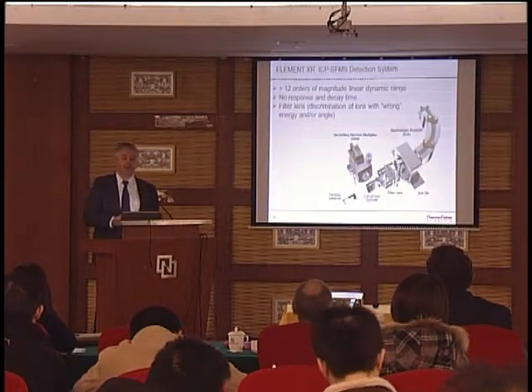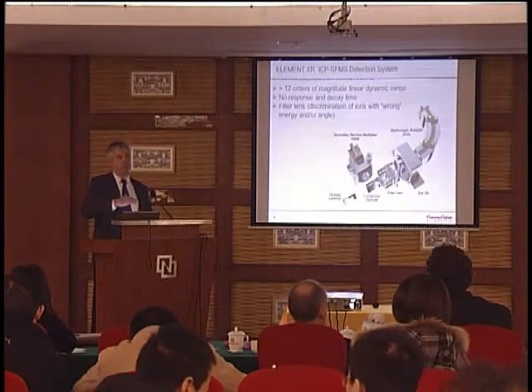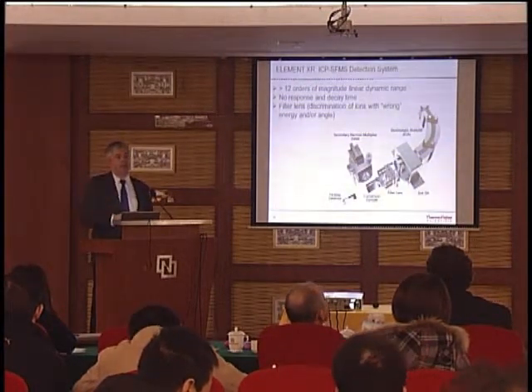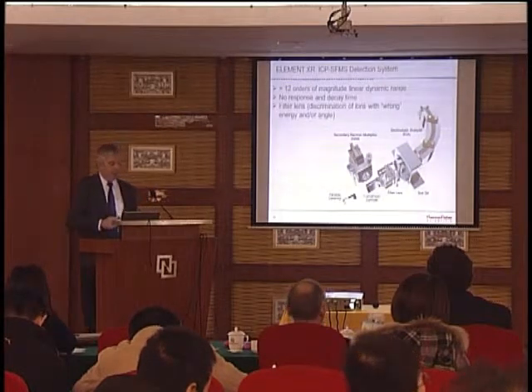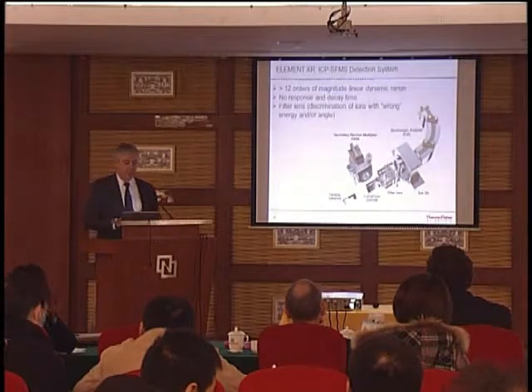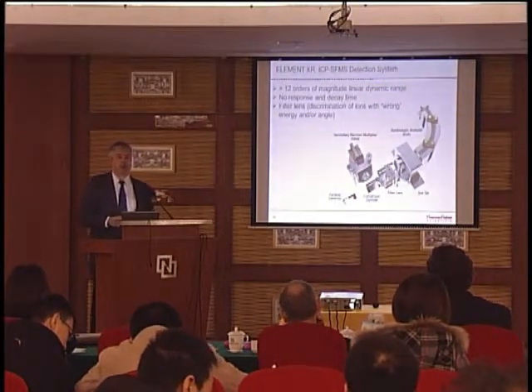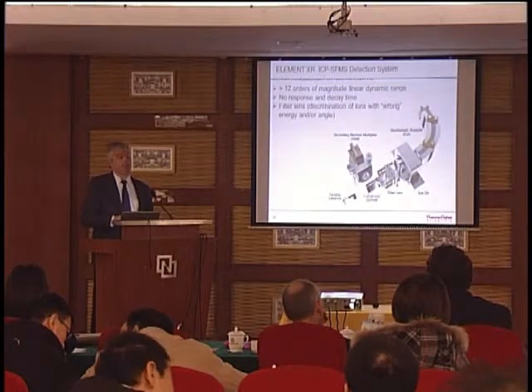The electronics is done in a way that you don't have any response or decay when jumping from a small intensity to a high and back without any delay. And the filter lens, that's for discrimination of ions with the wrong angle or energy. What does it mean?